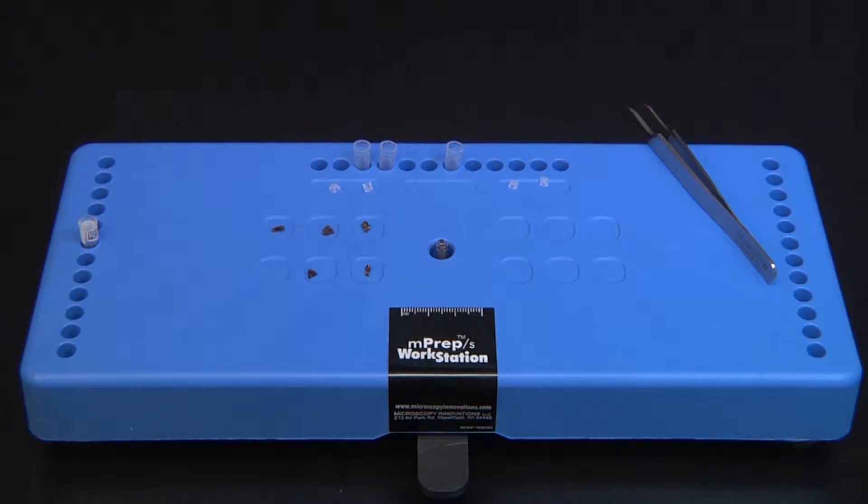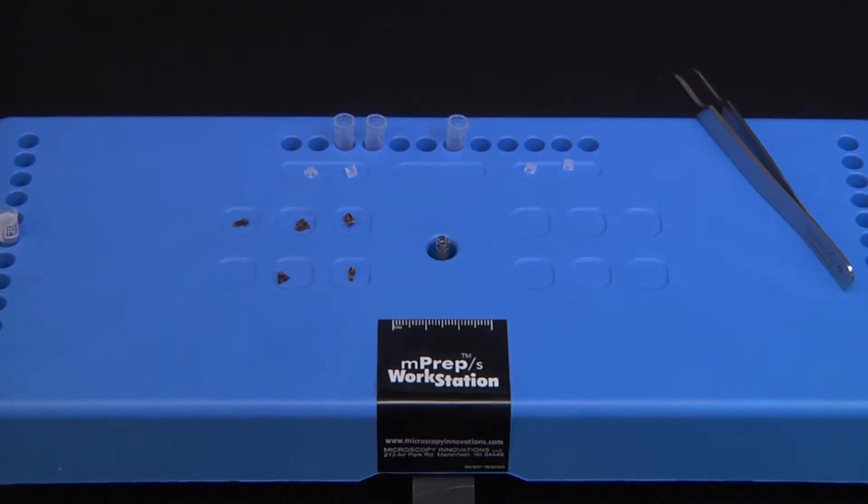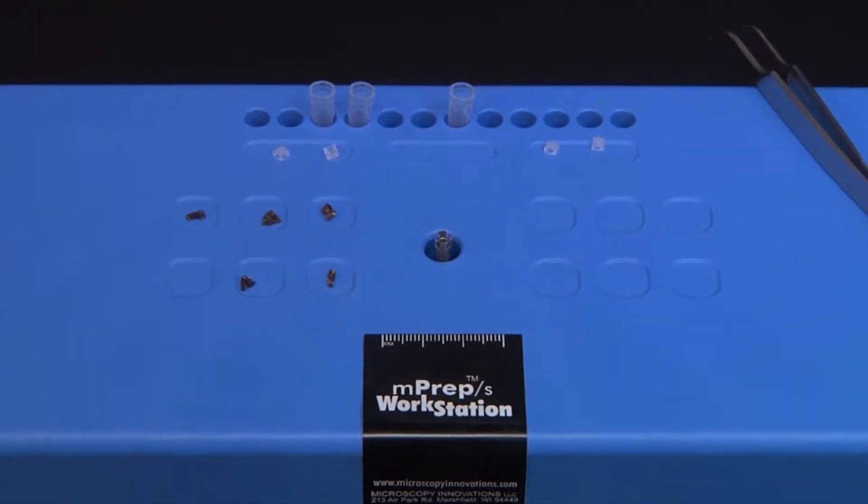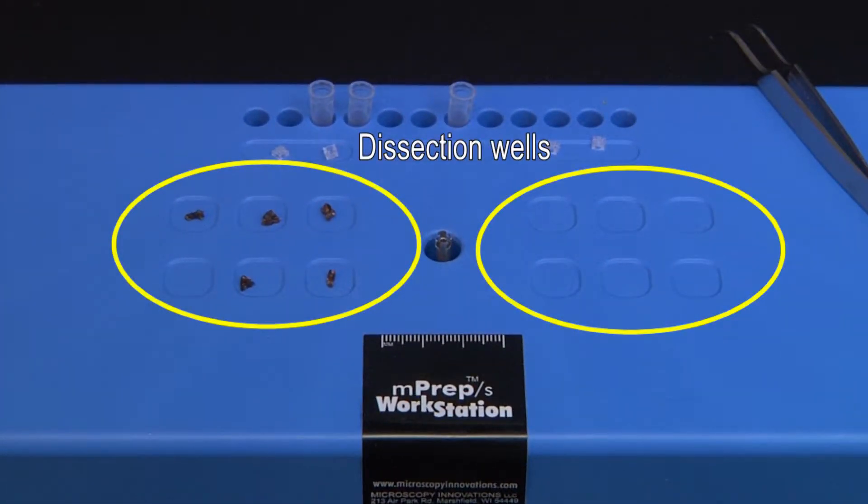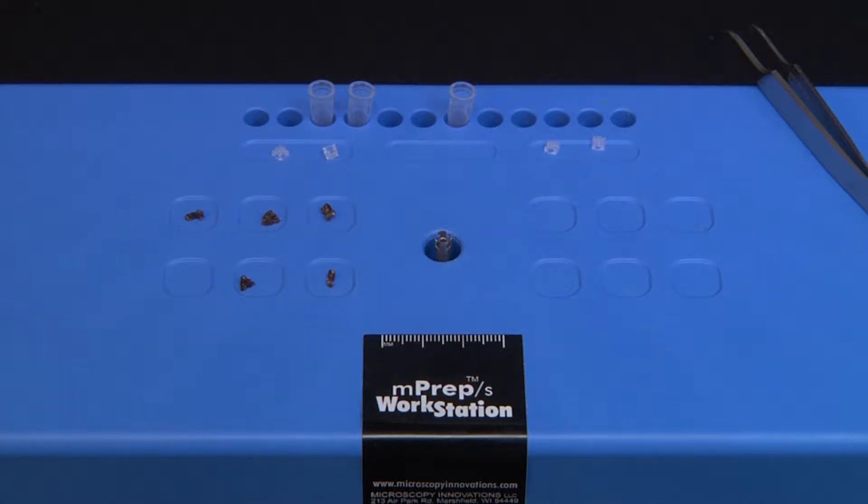The workstation top is made from soft polyethylene to enable dissecting and cutting specimens without dulling tools. Specimens can be kept organized and moist by dissecting in the 12 dissection wells.